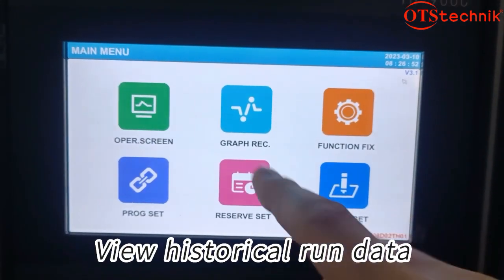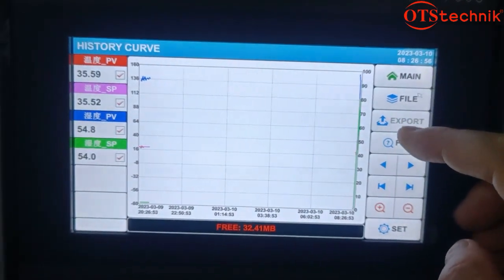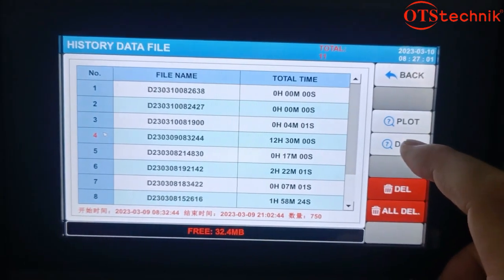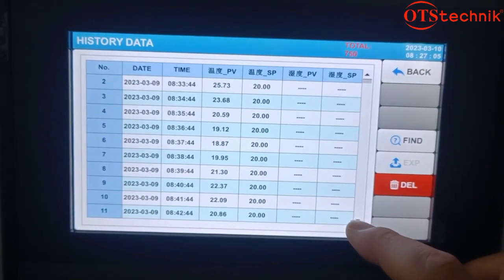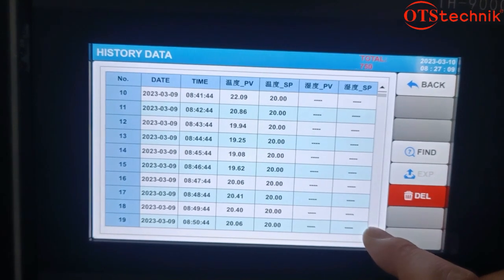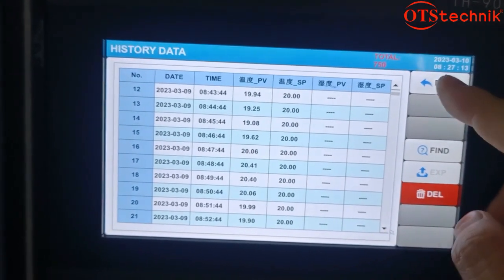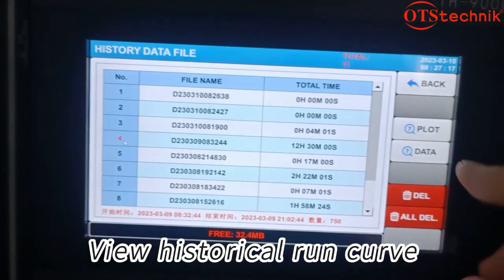Create new historical run data and view historical run data.